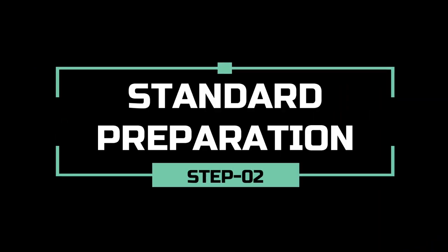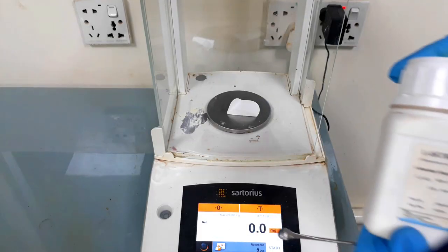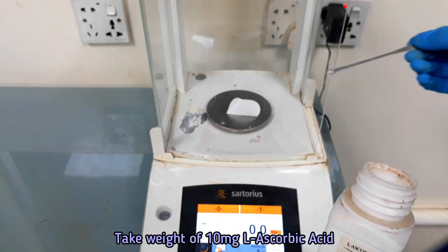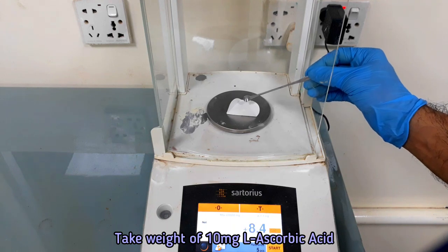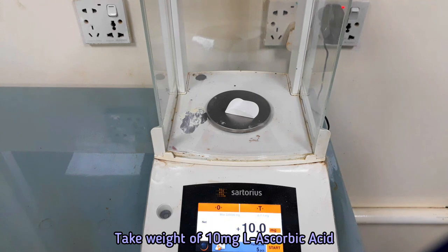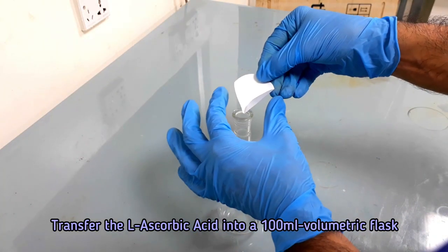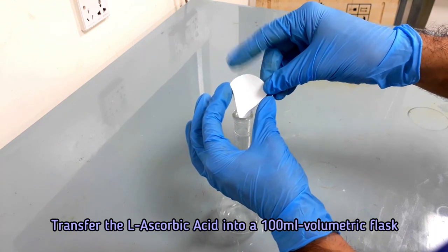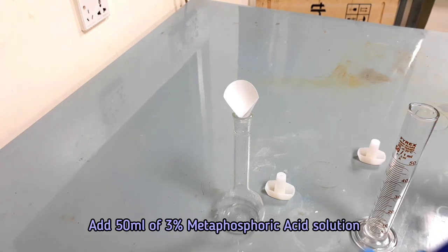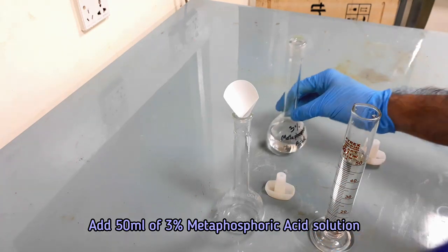Now we will prepare standard solution of vitamin C. Take weight of 10 mg L-ascorbic acid. Transfer the L-ascorbic acid into a 100 ml volumetric flask. Add 50 ml of 3% metaphosphoric acid solution.